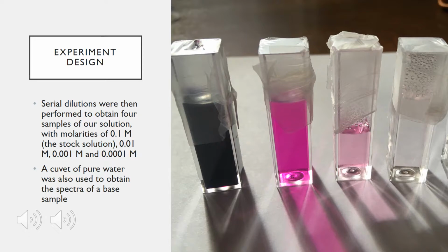Then 1 milliliter of this 1 to 10 diluted sample is placed in the next 9 milliliters of water to create a 1 to 100 ratio. And then 1 milliliter of this 1 to 100 ratio sample is placed in another 9 milliliters of water to create a 1 to 1000 ratio sample, thus increasing each ratio tenfold and giving us proper samples.